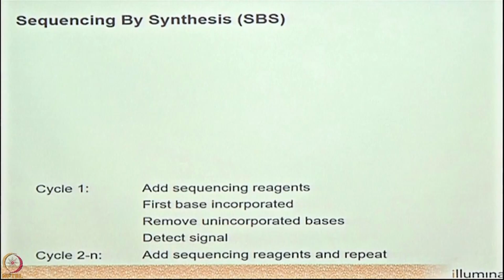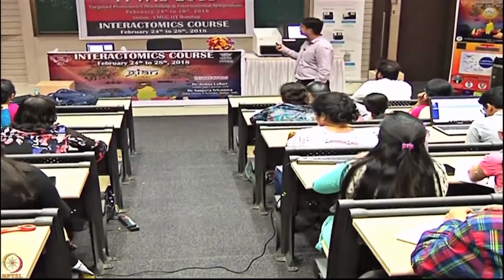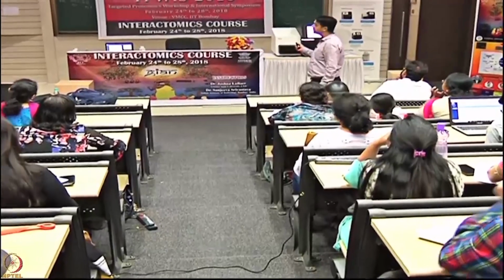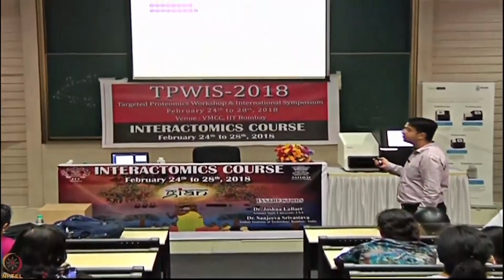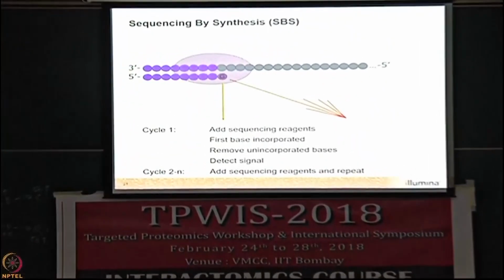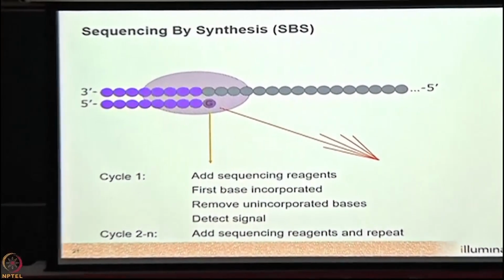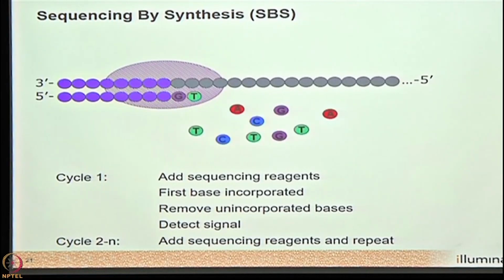With Illumina, we essentially mimic Sanger sequencing, just like the natural phenomenon. We have 4 kinds of bases. Let's say there is your strand, and we have added a primer. You can see all these bases are labeled with a fluorophore. One at a time, one base will go and bind to the sequence. It will be detected just like Sanger. We wash away the unbound bases and then we are set to go for the next cycle. So there is direct detection of the bases. Let's say you are running a sample of 300 cycles. So 300 bases will go and bind. This is your one fragment. Okay.